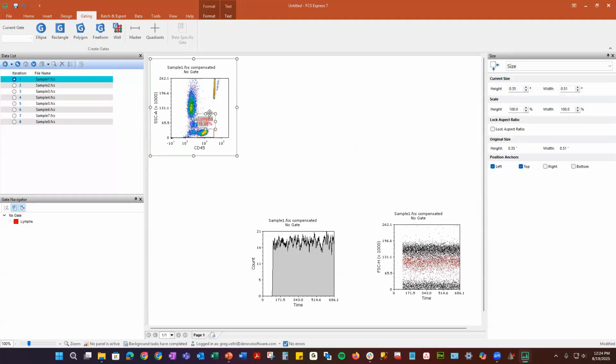You'll also see over here that we have a dialog text box that says the percentage of lymphocytes that are in this plot. Now, I also noticed, on purpose, that a rectangle gate is probably not the best gate for this population because it kind of comes like this, and I'm missing out some things, and I don't want to bring this all into my monocytes.